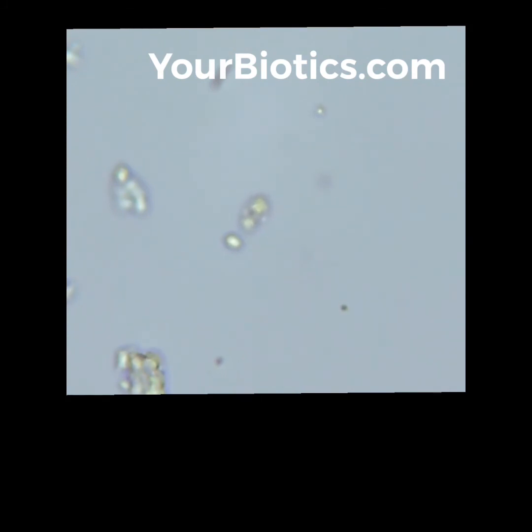Notice that they're all glowing. When I show you other ones later, you won't see this, because energy is the key. The Your Biotics microbes are full of life and full of energy. Even though they're in a powdered form, they are not freeze-dried — they are powder-dried, which is our invention. You simply add water and it springs to life. Just add a pinch of powder to water, stir, put it in a pipette, and place it on the slide — it immediately comes to life and starts to energize.